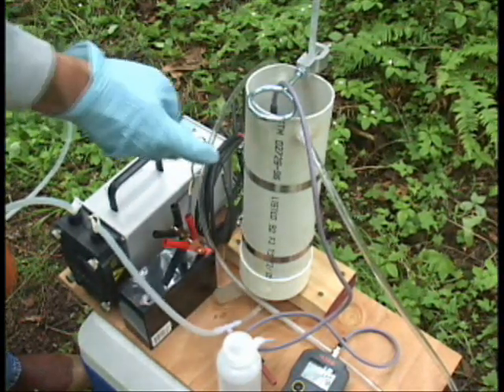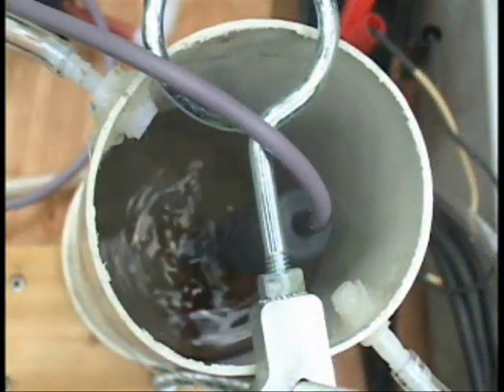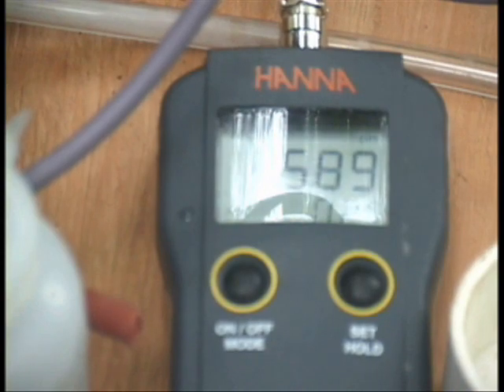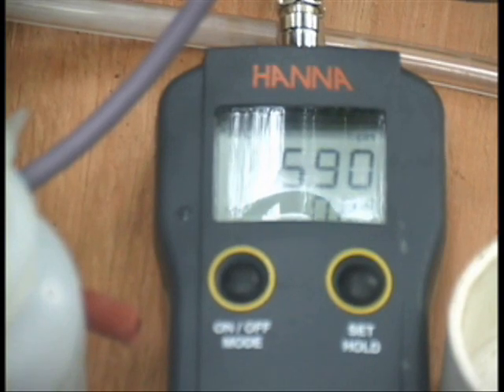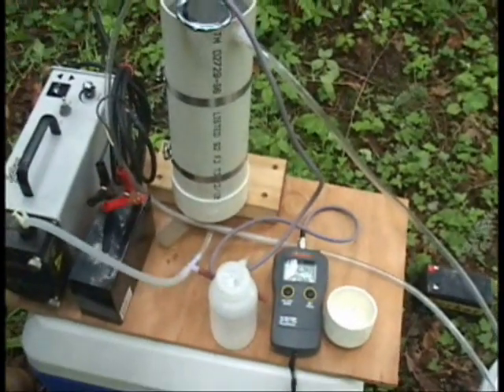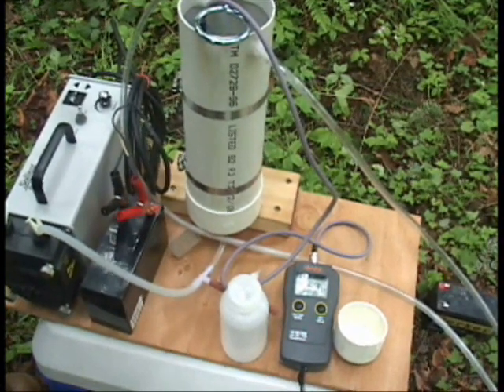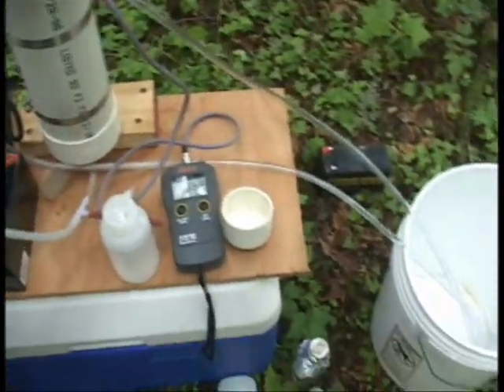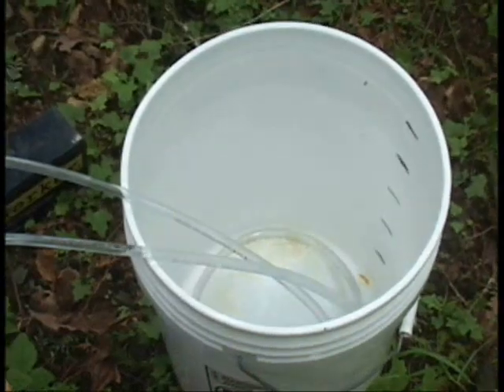We've constructed a flow cell here that's open at the top. This allows any size probe to be inserted. We toggle through pH, conductivity, and temperature while doing the purging, and we determine when those readings stabilize — that tells us when we can take the samples. We also track the well volume at the same time.